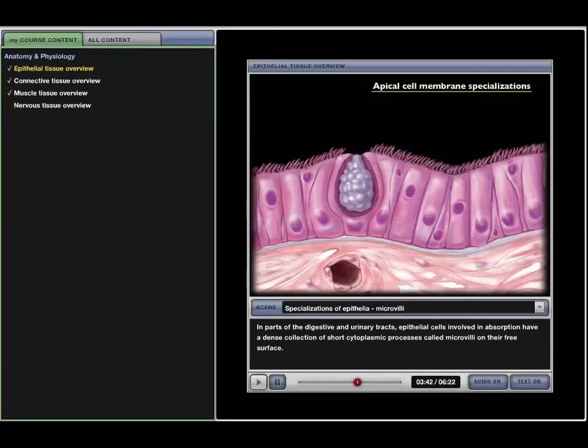This video is a brief tutorial that may help you out during one of the activities in the lab this week. And that activity is to measure and compare the heights of different types of epithelial cells. To do this, you'll view the tissues under the microscope and use an ocular micrometer, which is a measuring guide that's placed in one of the oculars of the microscope.